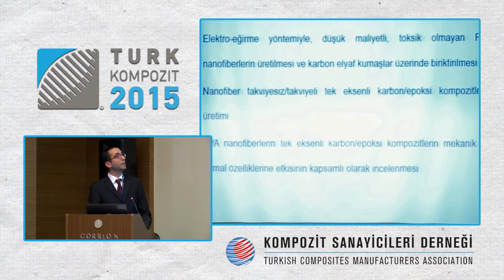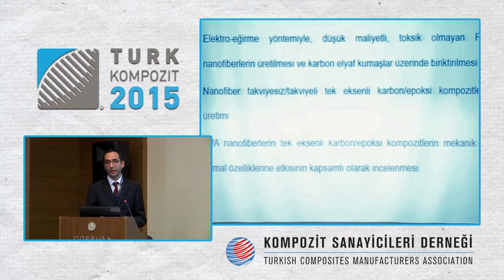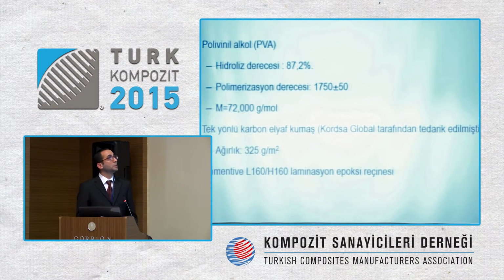And the purpose of this study is to manufacture the PVA nanofibers with non-toxicity and low costs through electrospinning methodologies, and make sure that they do collect on carbon fibers. And the material used is polyvinyl alcohol.